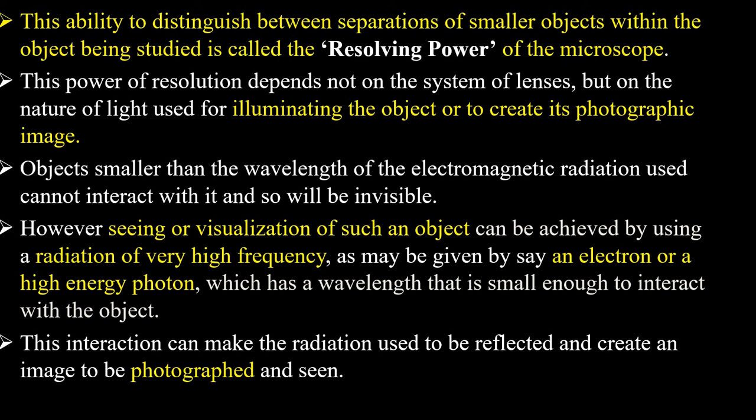This power of resolution depends not on the system of the lenses but on the nature of the light used for illuminating the object or to create its photographic image. Objects smaller than the wavelength of the electromagnetic radiation used cannot interact with it and so will be invisible.